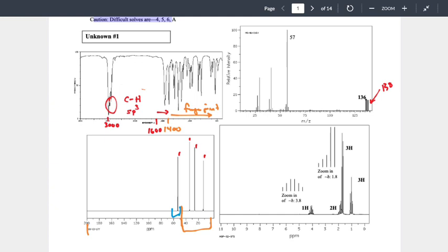I could also get away, full disclosure, saying that's at 55. The little range was like 50-ish. Could I just say that's 4 alkanes? Yes. That's perfectly reasonable to do. Just like with IR, the range is a little bit different, the shape is a little bit different. There's a little bit of a fudge factor when you're looking at your types of carbons, or for that matter, the types of hydrogens. Those are very loose, quick interpretations.